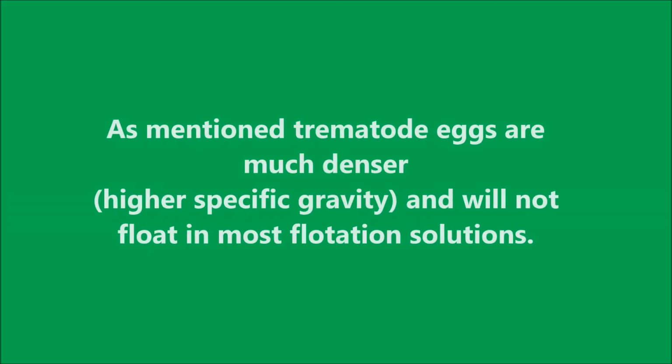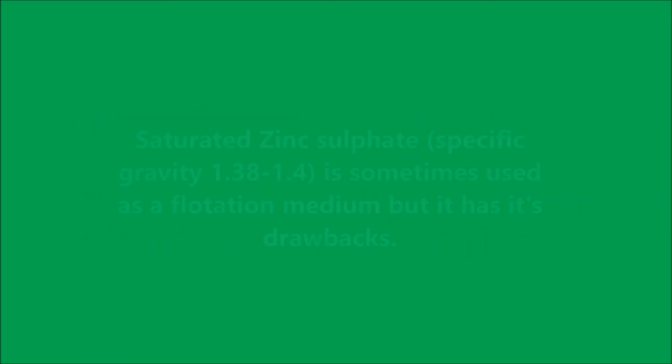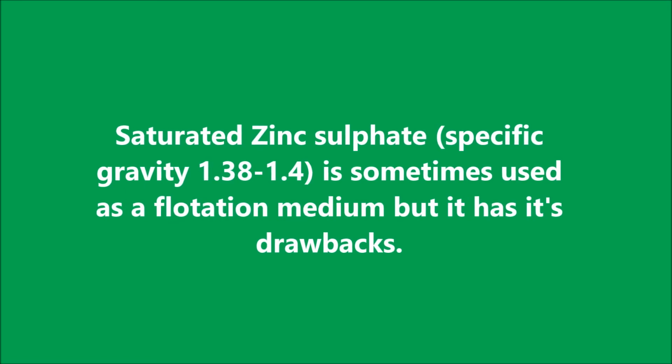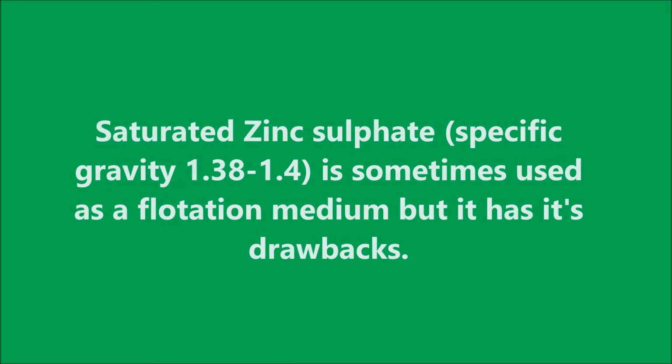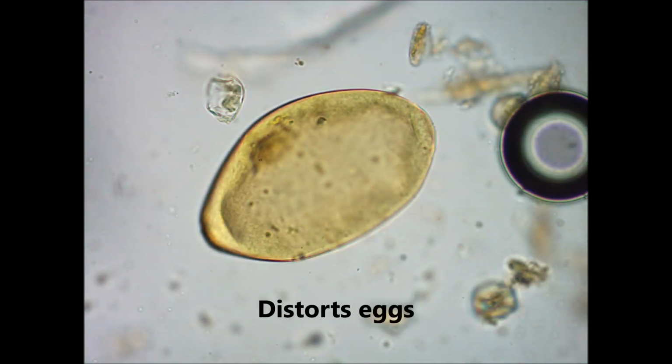As mentioned previously, trematode eggs are much denser and will not float in most flotation solutions. Saturated zinc sulphate with an SG of 1.4 is sometimes used as a flotation medium, but it has its drawbacks. As you can see from this image, eggs are distorted and unrecognisable. Therefore, flotation is not a recommended test of choice for the detection of fluke eggs.